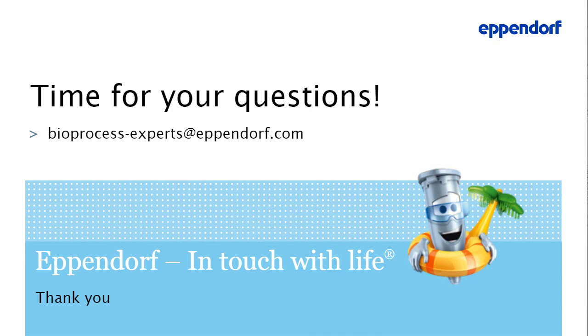Thank you very much. And the final question that we'll have time for today is, we experience cell clumping. We use mammalian cells in shake flasks. Is there anything that we can do? Yeah, shaking already is helpful. I would say better than static incubation. It prevents sedimentation and cell clumping.